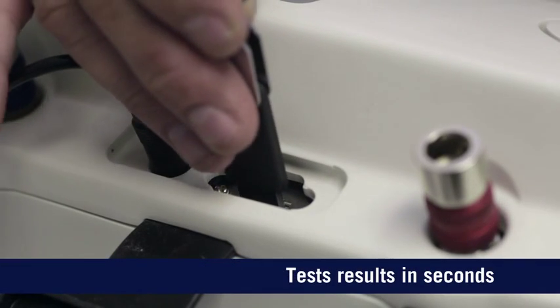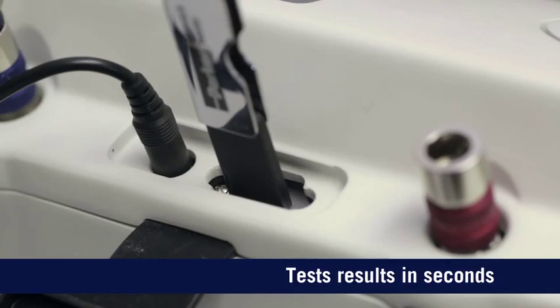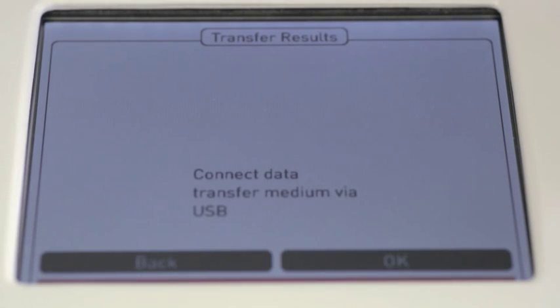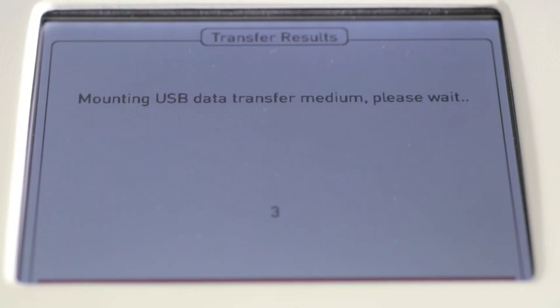Results are stored on the USB stick supplied, which are easily transferred to a PC for QA monitoring. No additional software is required.